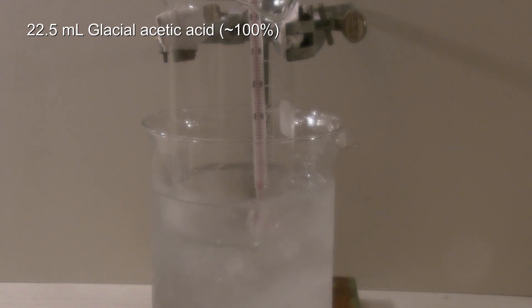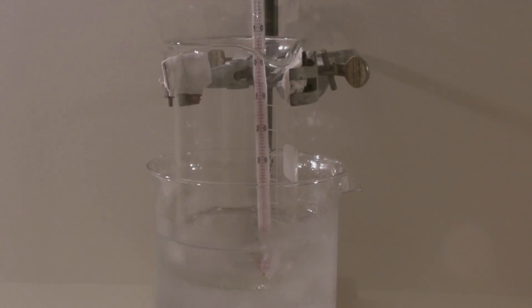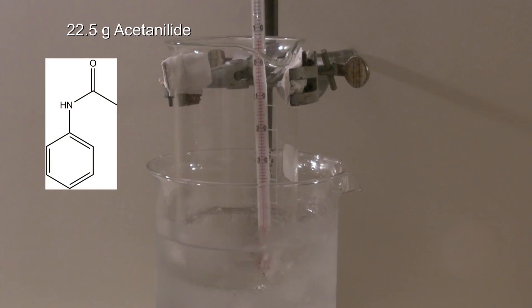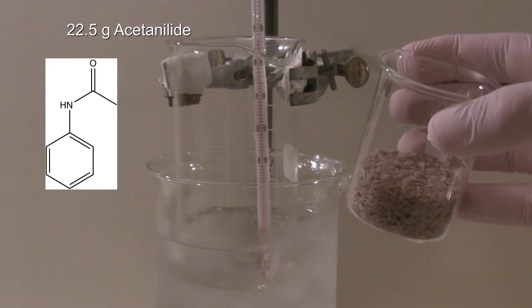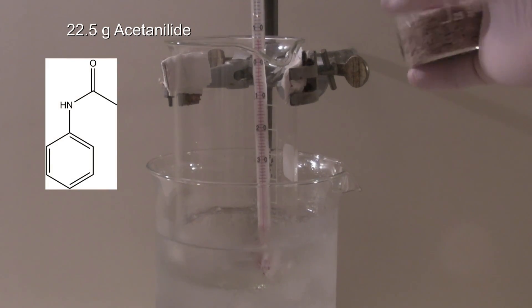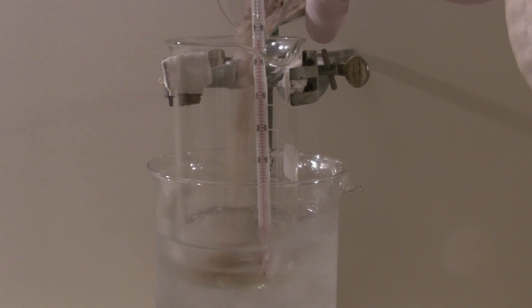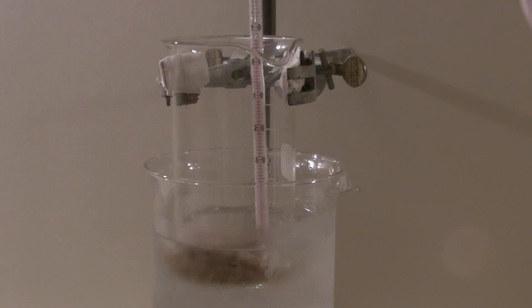Then 22.5 ml of glacial acetic acid are added to the beaker. To this 22.5 grams of acetanilide are added. Then it is mixed a bit with a glass rod.